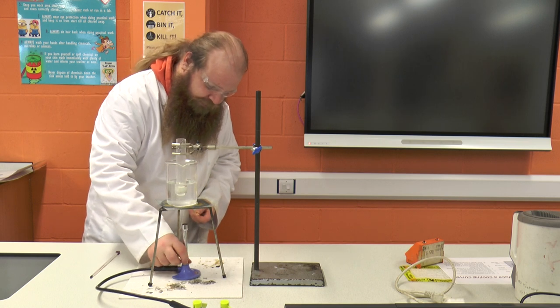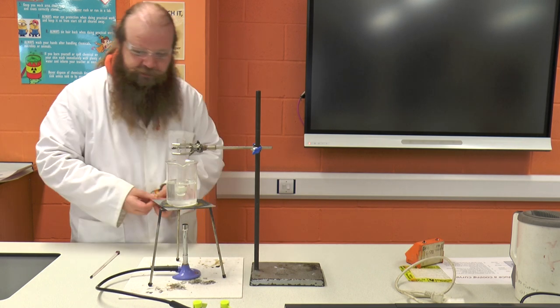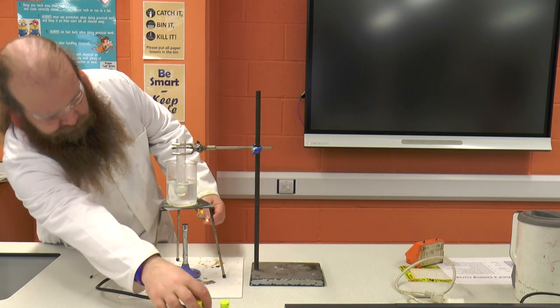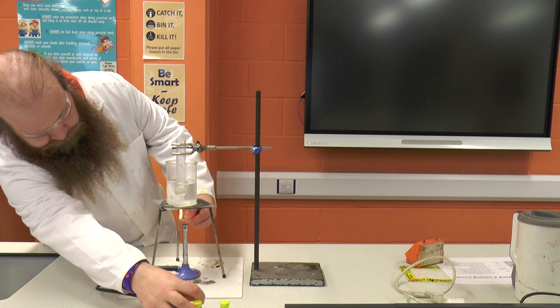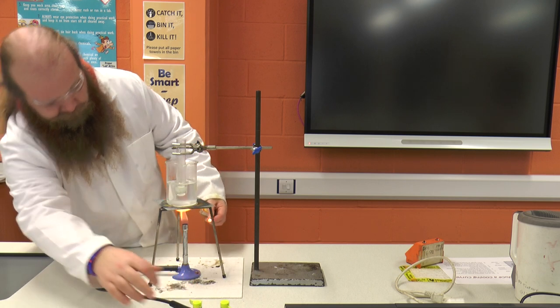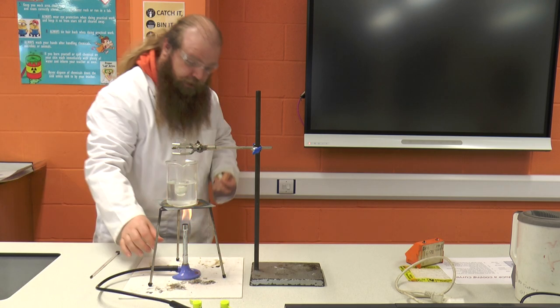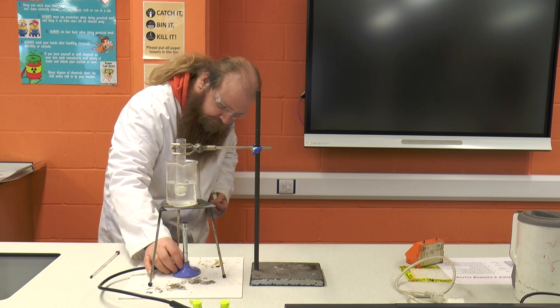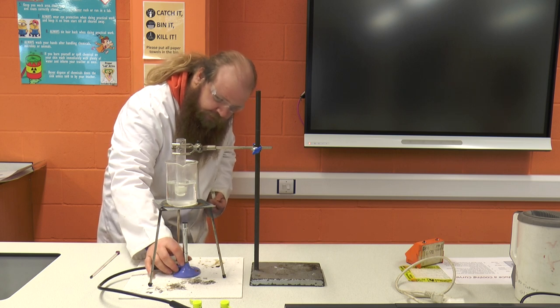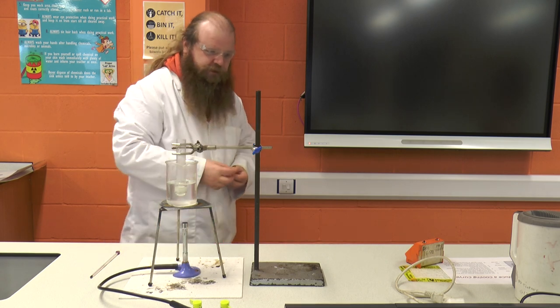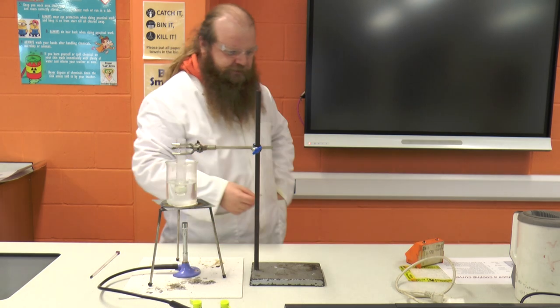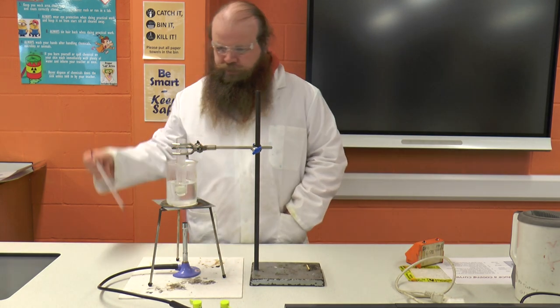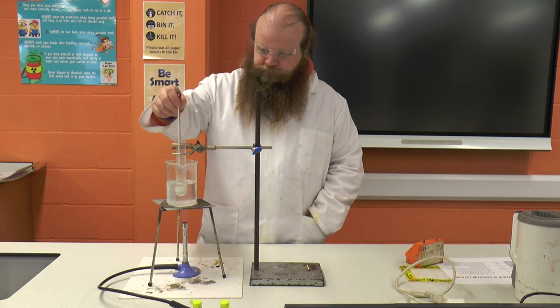We're going to set our Bunsen burner to safety flame and then we're going to light it and nicely heat our water so that we can get the stearic acid to melt. We can use our thermometer to monitor the temperature.